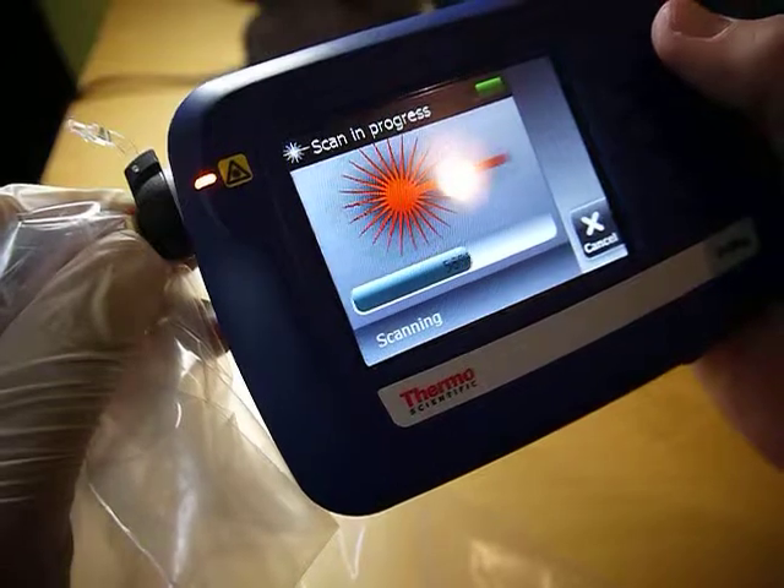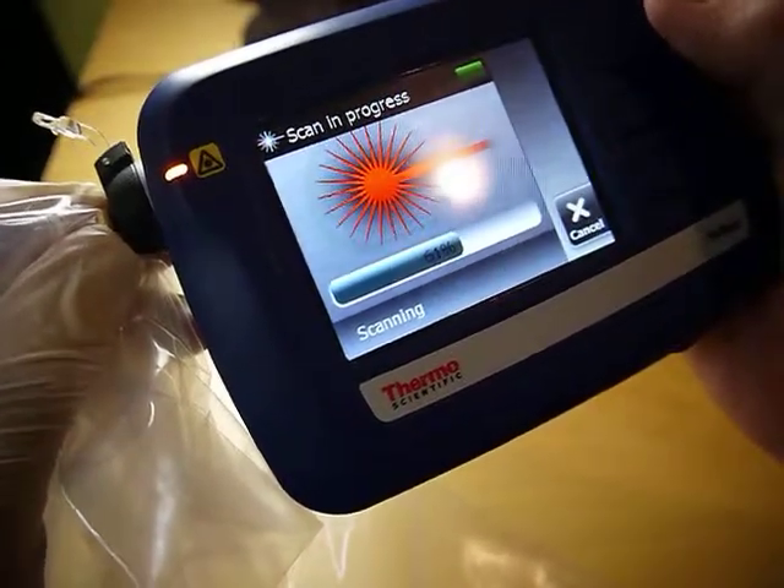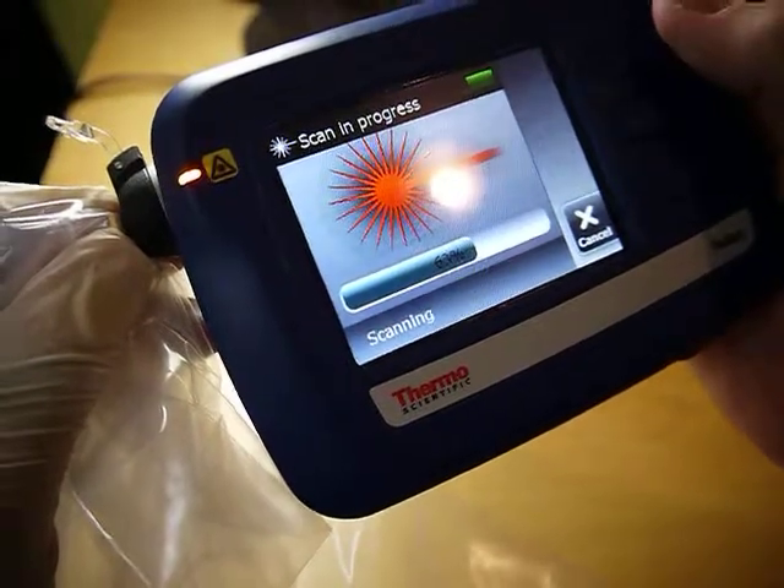I was kind of going through this. I put the pill against it and hit scan. You can see the progress bar as it's taking multiple measurements.